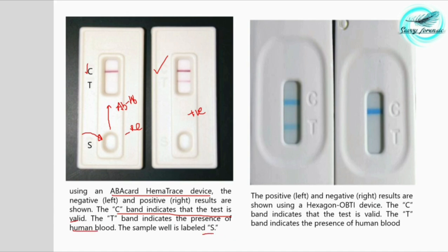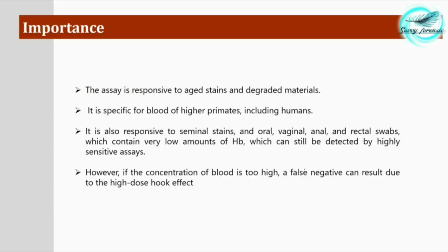This is another kit — the Hexagon Opti device. Here both the control zone and test zone give positive results when a sample is present. With no sample, only the control zone shows a result. This is very clear.